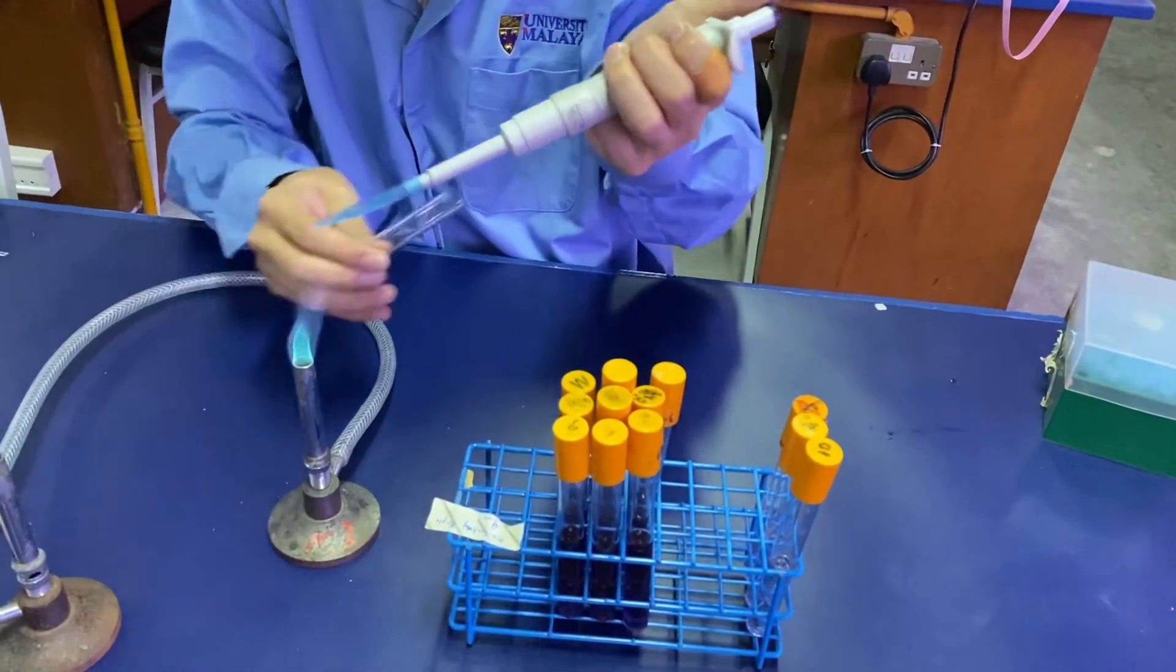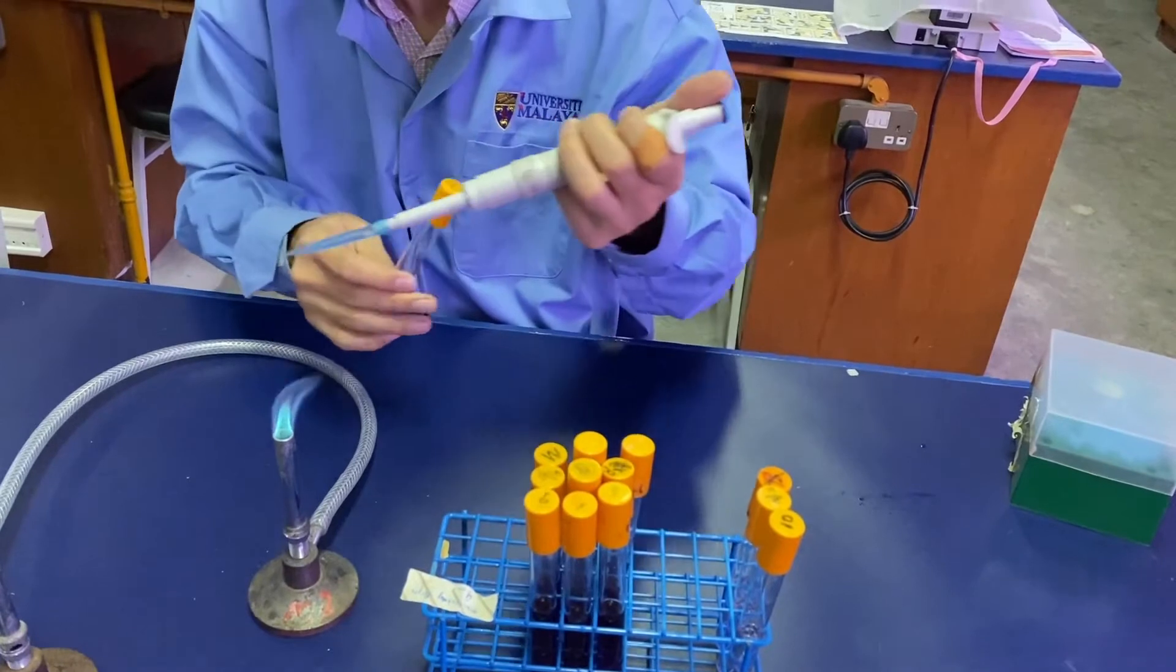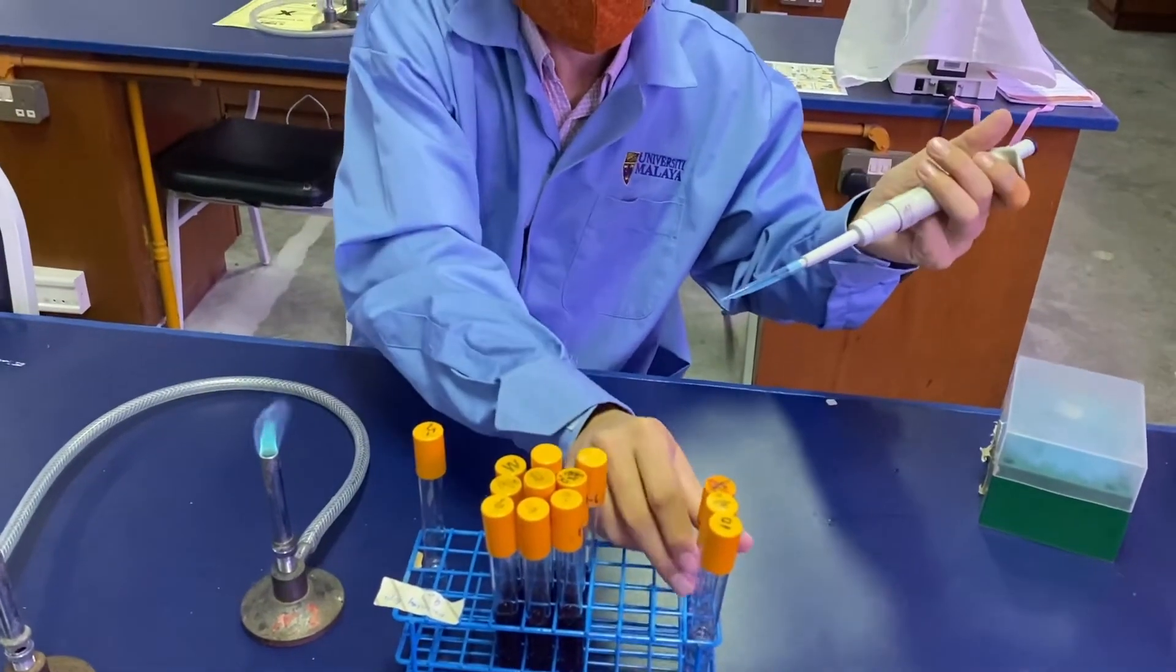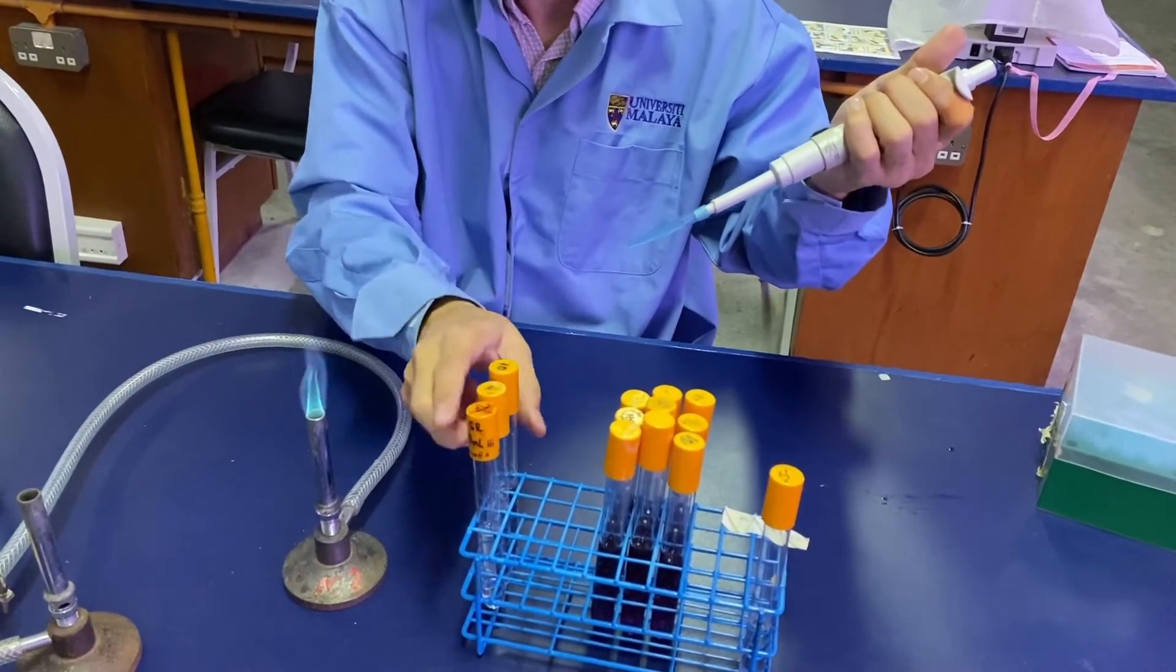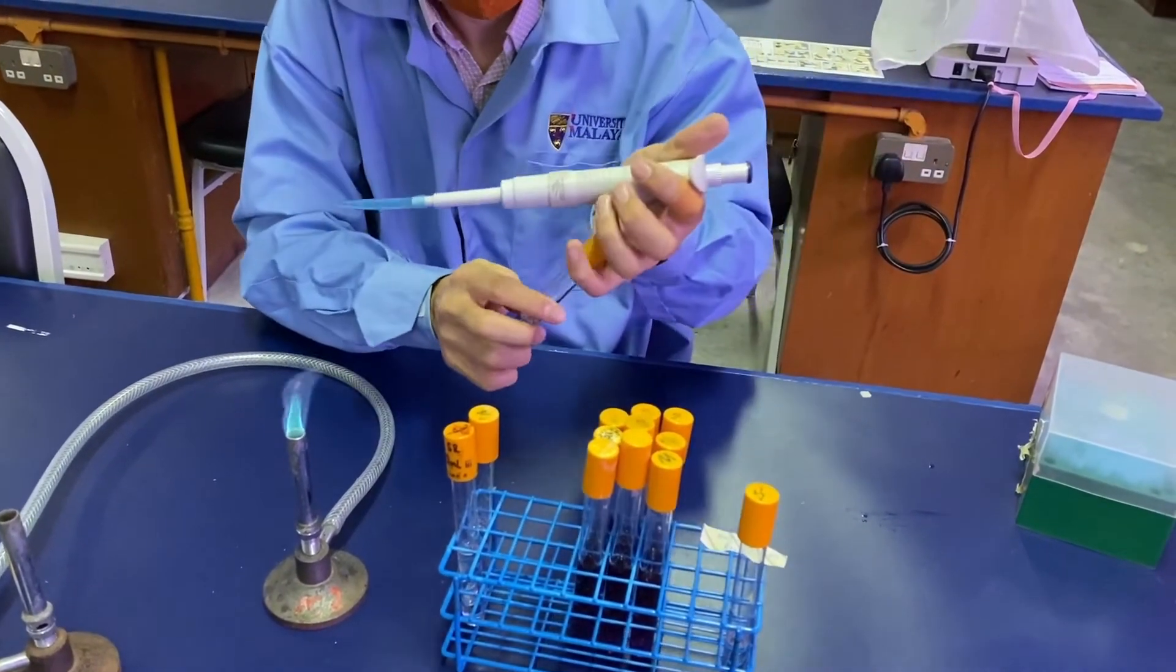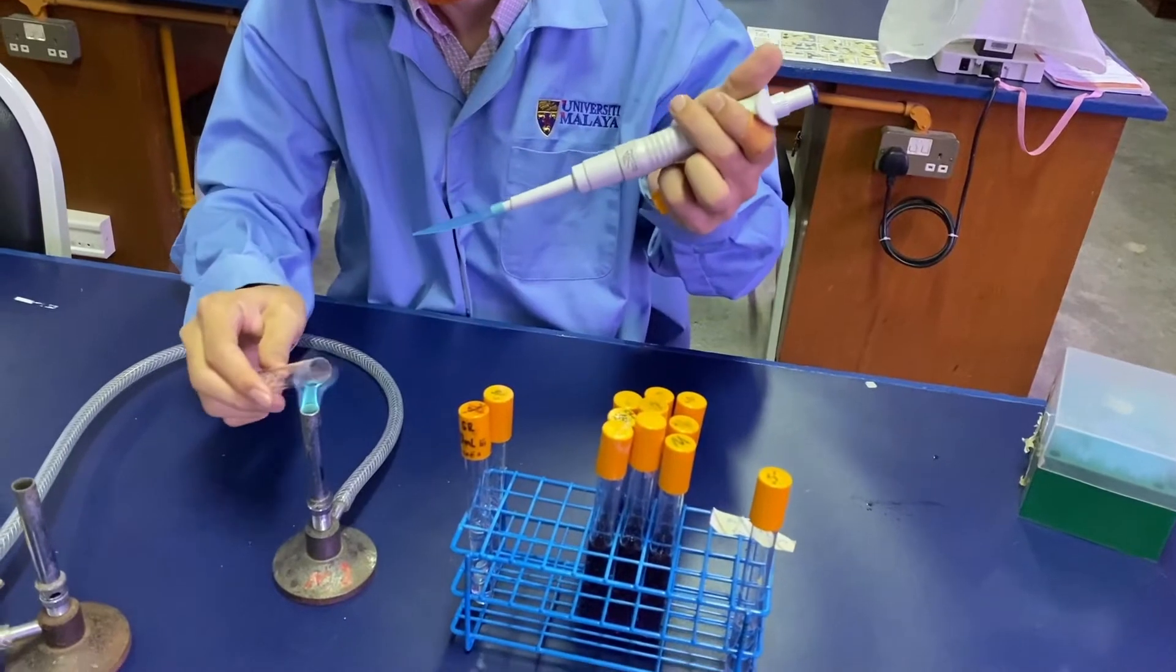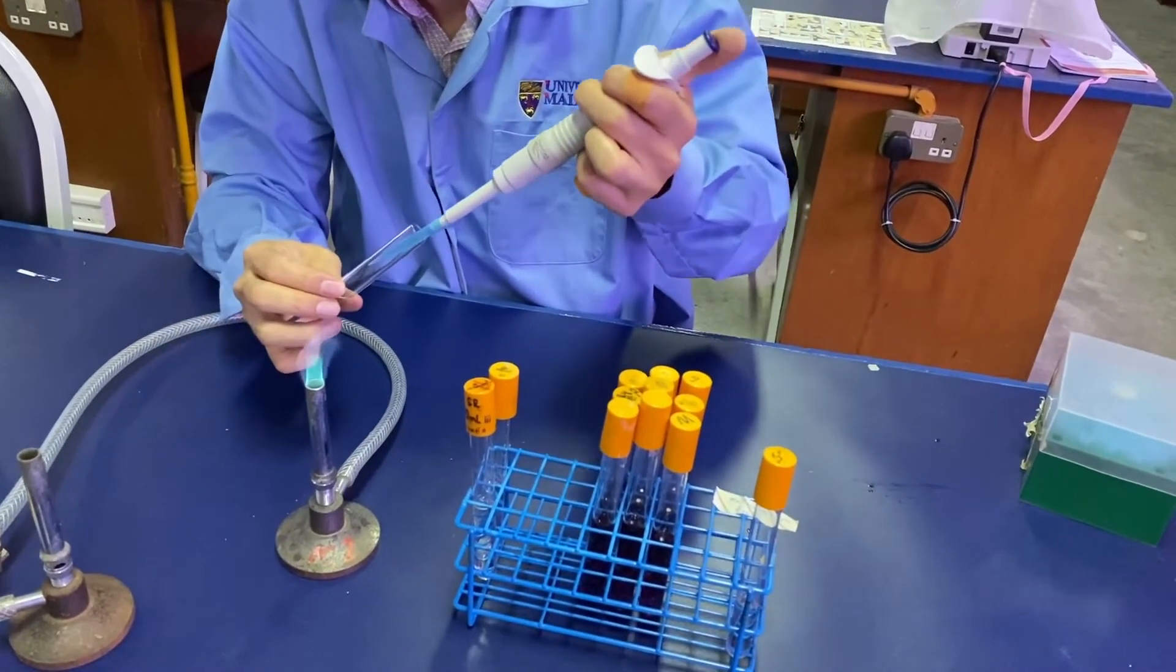We always flame the mouth of the test tube to expand the air there, so that no contamination from the surrounding air goes into the tube. We'll start with the minus one tube.